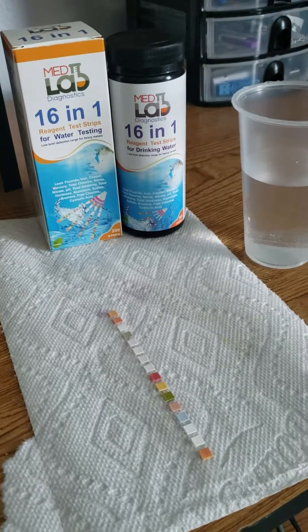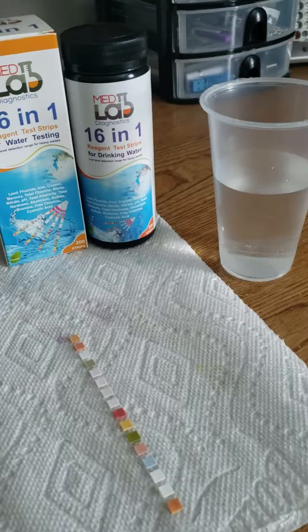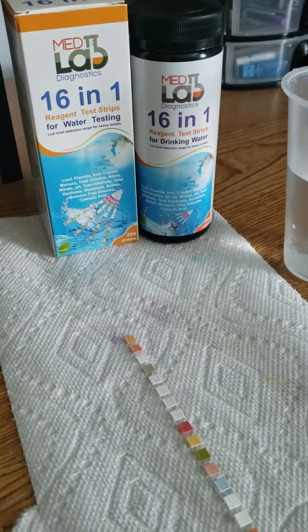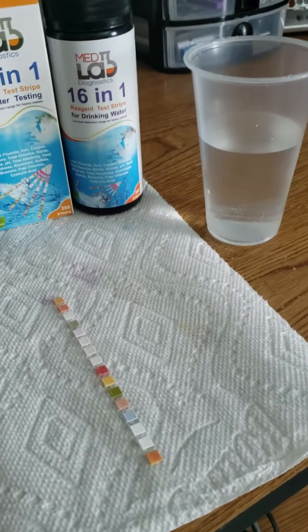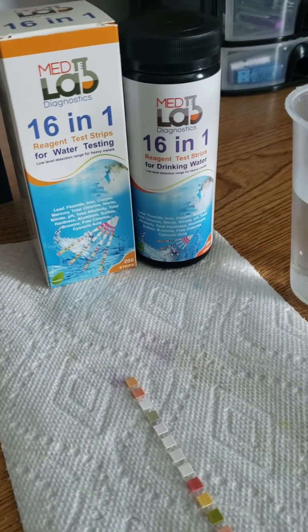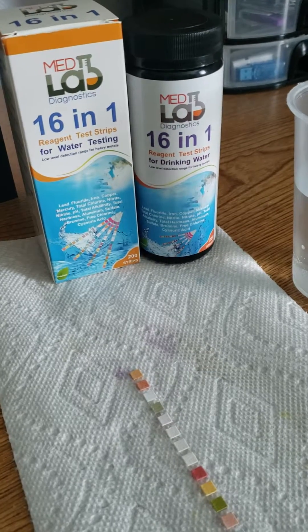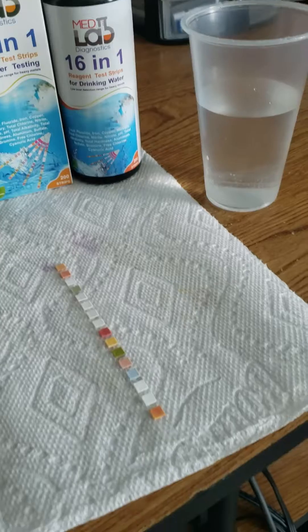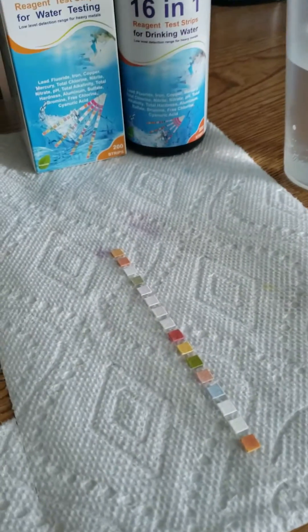Hello, this is Elena with MedLab Diagnostics doing a quick video on how to use your 16-in-1 reagent test strips for drinking water. These strips can be used to test any kind of water — pool water, spa, hot tub, well water, groundwater, drinking water — any type of water where you want to check to see if there are any contaminants.